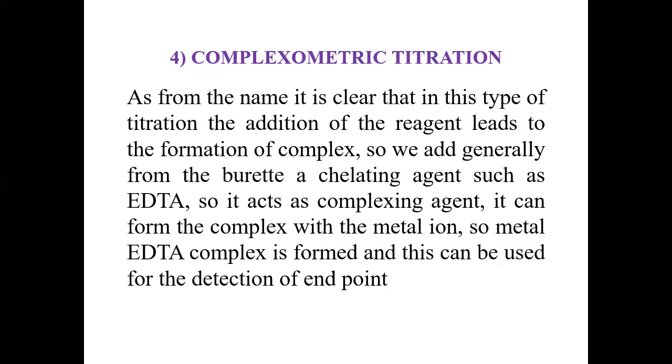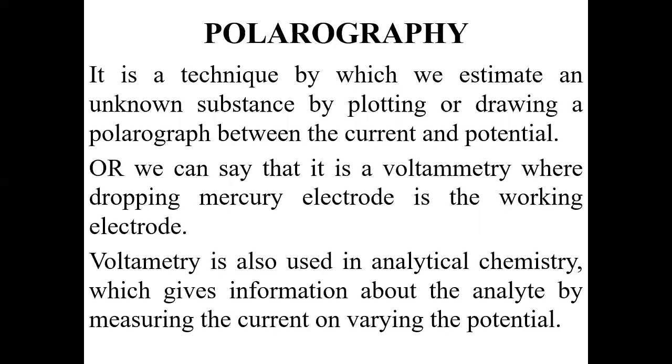So these are all about potentiometry. Next topic we will discuss polarography.